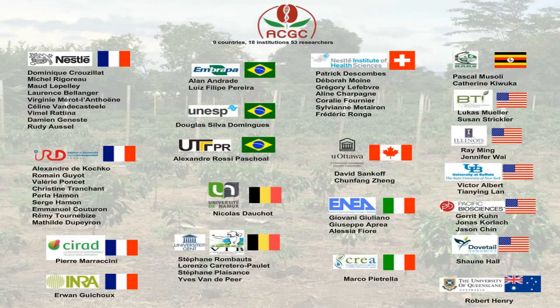Can you go straight from a de novo assembly to Hi-C, and when would you use Chicago? Sure, of course. So the difference between Chicago and Hi-C is the characteristics of the data. Chicago is more intermediate scale. So if your N50 is in kilobases, we would strongly recommend you go to a Chicago. That will hopefully bring it up to megabase level N50. And once you reach that, we should be able to go up to use Hi-C, where we can bridge longer scaffolds. So it depends on the N50 size of what you're assembling.